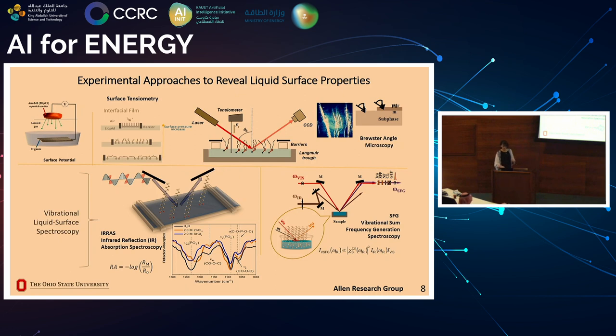So across the top row, we utilize Langmuir isotherms for organic films. And in the top right, we do quite a bit of imaging with Brewster angle imaging of the structures and the two-dimensional layers, as well as three-dimensional aggregation. In the bottom row, you see vibrational spectroscopy. So we're quite well known for vibrational spectroscopy and surface selective techniques.